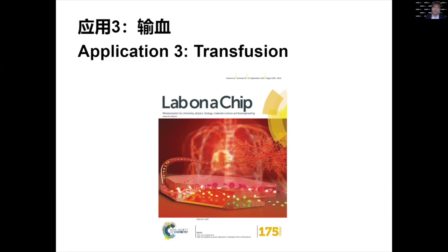Because you can imagine, you want to transfuse the blood in a very short period of time. Speed is very, very important. The kind of speed is tens of to even 100 milliliters per minute. Now the gold standard way to do it is centrifugation. But centrifugation could damage the cell components, and later you're going to transfuse the cells for a therapeutic purpose. If the blood quality is not very good, it causes a lot of complications, and it does cause a lot of complications.